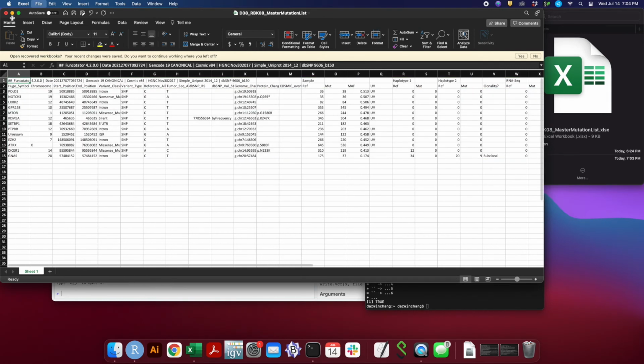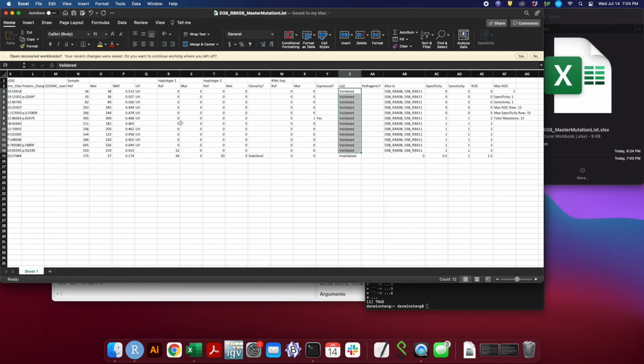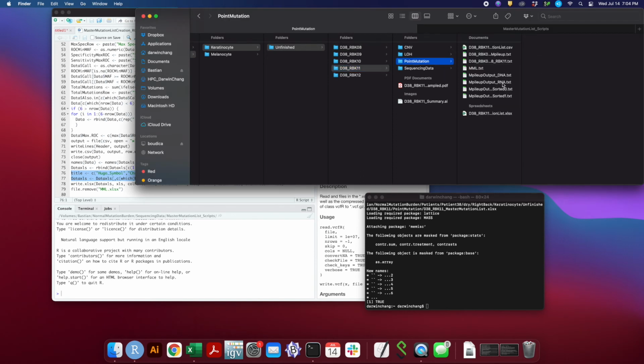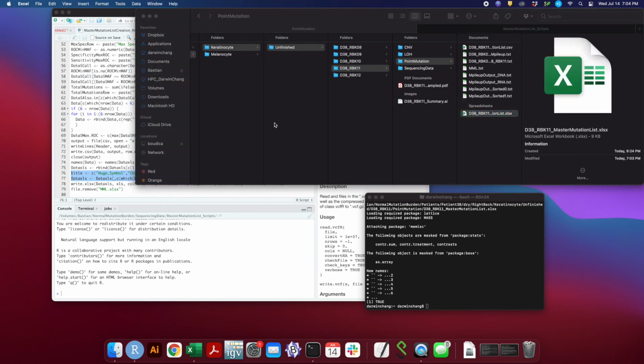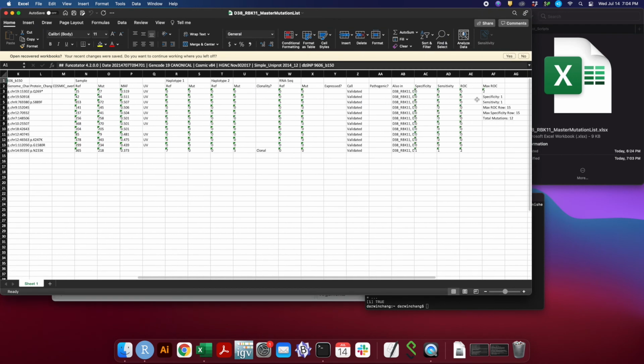So save that. Based off of the information we see here, there's actually a very high chance that these two samples are probably cultural artifacts, because out of the 12 mutations found, all of them are related to one another. However, there's no guarantee with that few number of mutations. There might be more confidence if there were, say, 50 mutations that were all related to one another.